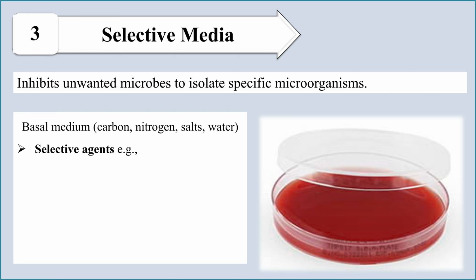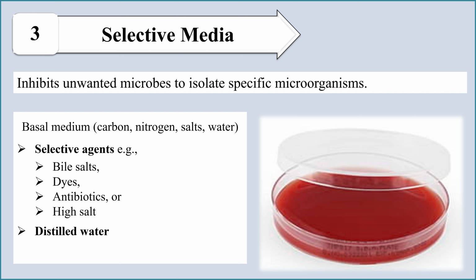So these additional nutrients are selective agents. In some media there will be bile salts, some require dyes, in some antibiotics or high salt, distilled water and agar. If a solid medium is required, then agar is required.